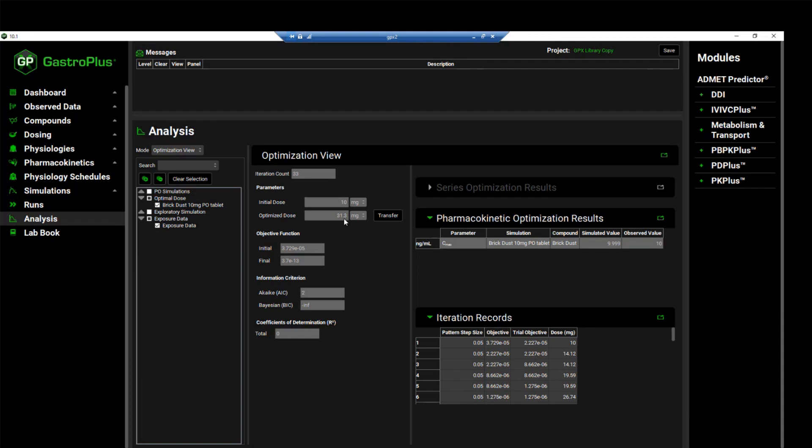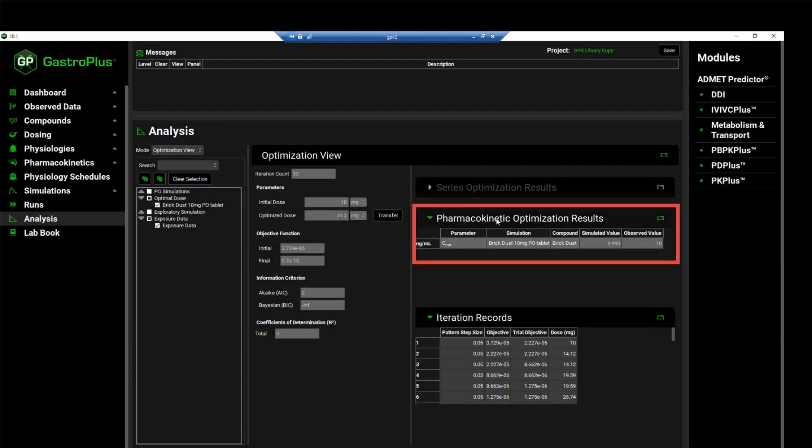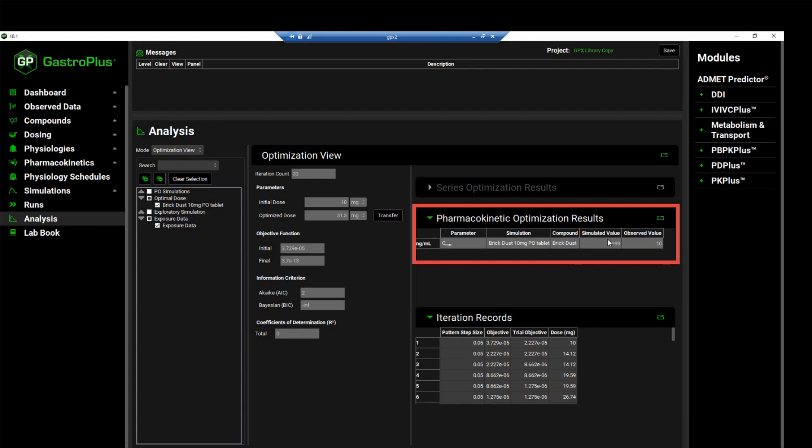Next to the optimized value, there is a button labeled transfer, and this button enables the final value to be transferred to the appropriate input field. On the right hand side, you can see the pharmacokinetic optimization results are also shown, which confirm that the simulated CMAX achieved is around 10 ng per ml or 9.999.